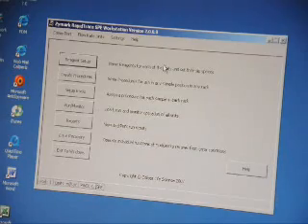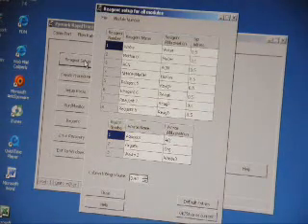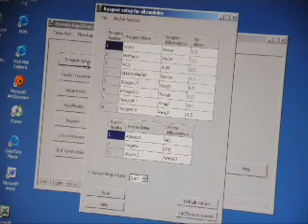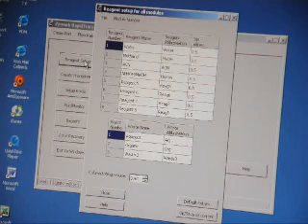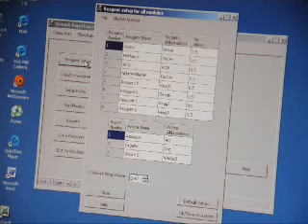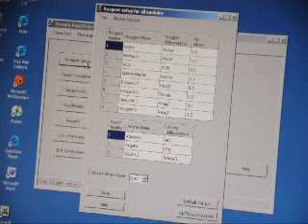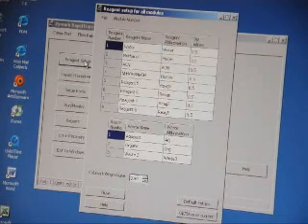In Reagent Setup, what we're doing is we're essentially telling the system in the eight reagent lines what is the name of the reagent we have present. When you're writing a method, it's a lot easier to know that Reagent 1 contains water because that's what it's named rather than remember that Reagent 1 is water. So in this case, we've named the reagents.